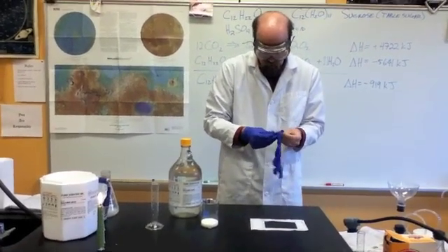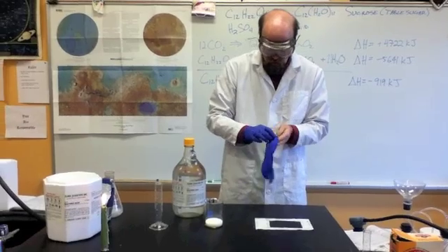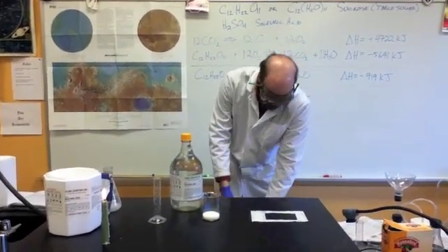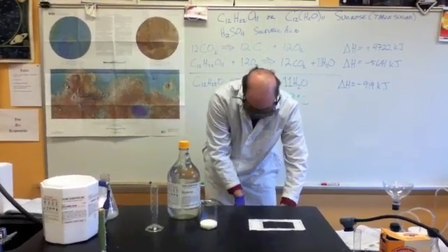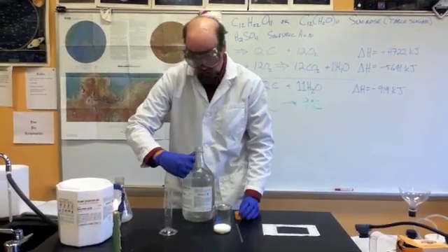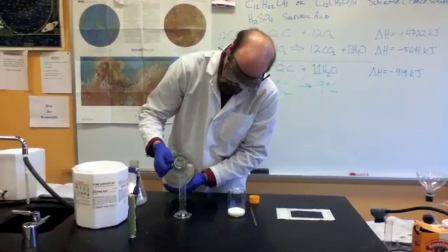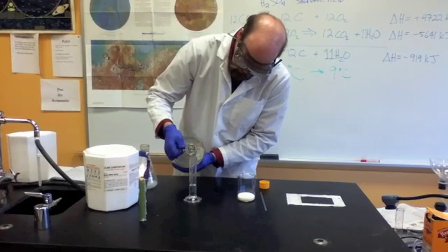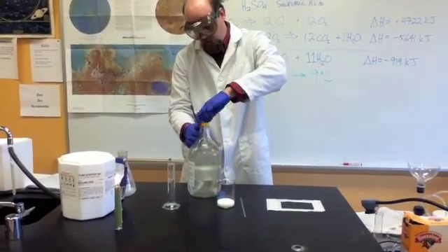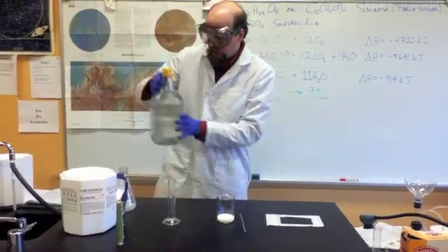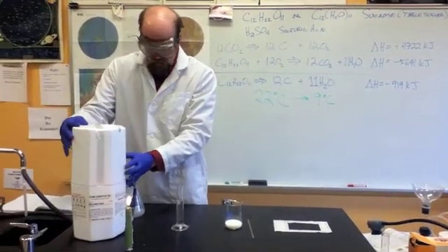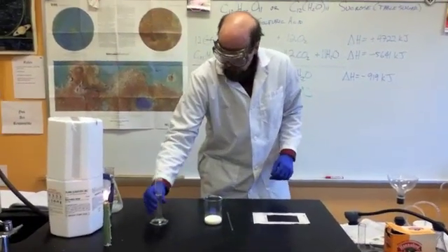I'm going to measure out 40 milliliters of this and I have about 40 grams of sugar in my beaker. It's very thick, viscous material. I'm going to close it up really tight and put it back in a nice safety container. Then I'm going to add it right to the sugar.